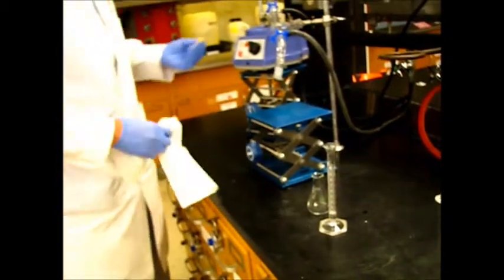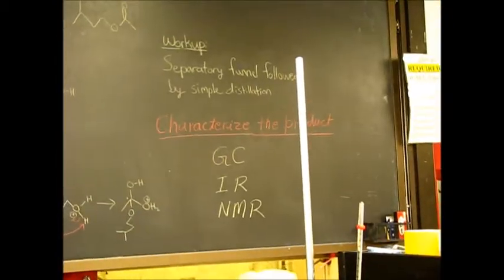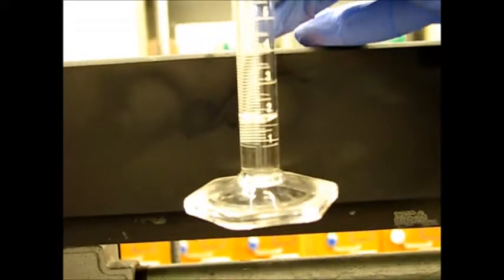Yeah, 1.8. So now we'll clean up our distillation apparatus, and then that'll be it. Then we characterize the product with GC, IR, and NMR. So from 1.8 ml, we have to calculate our product yield. Let's see from here. Okay, so it's around 1.8 ml of isopentyl acetate. We got it.